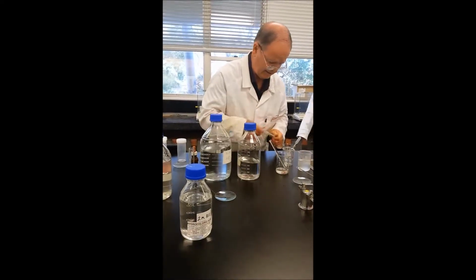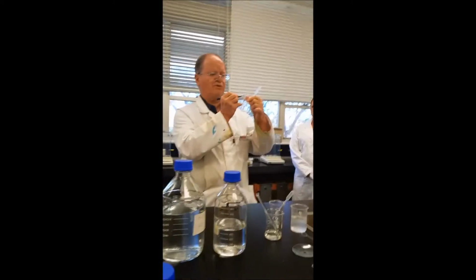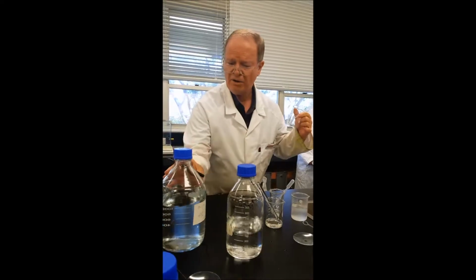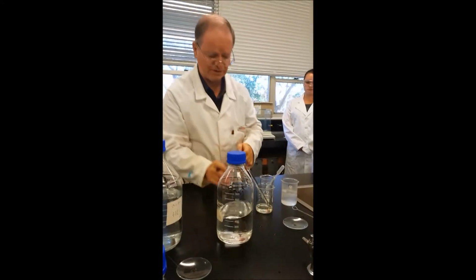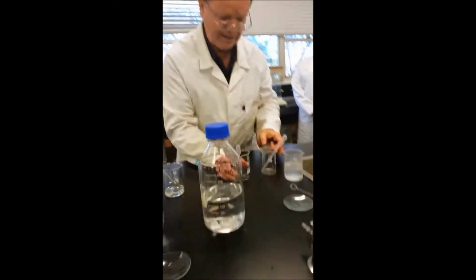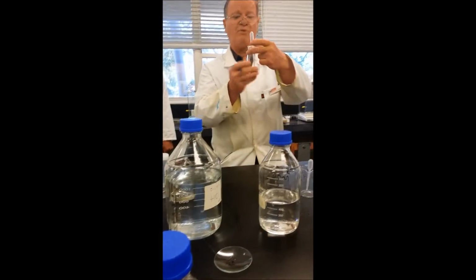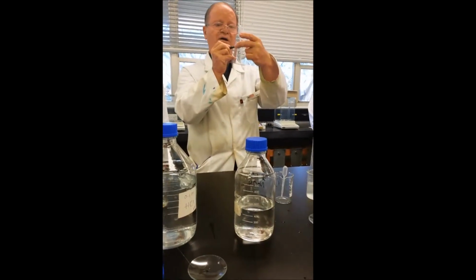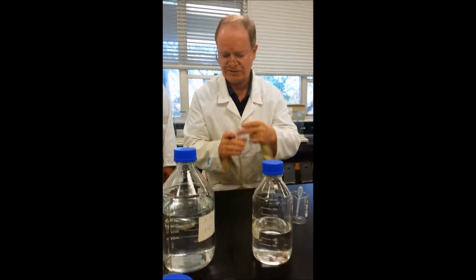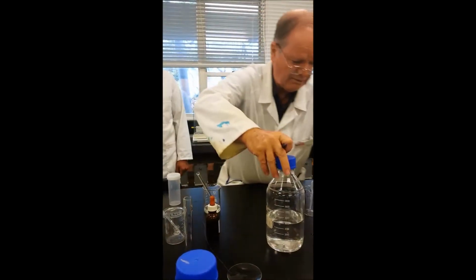Okay, now, right. So we're going to have to be ready for testing 0.1 M HCl. A backup way to minimise the chance of a mistake is to lay things out the way they're going to be laid in your table. So we have NaOH. Okay, so this goes to the right. Put this in the middle. That one goes to the left.